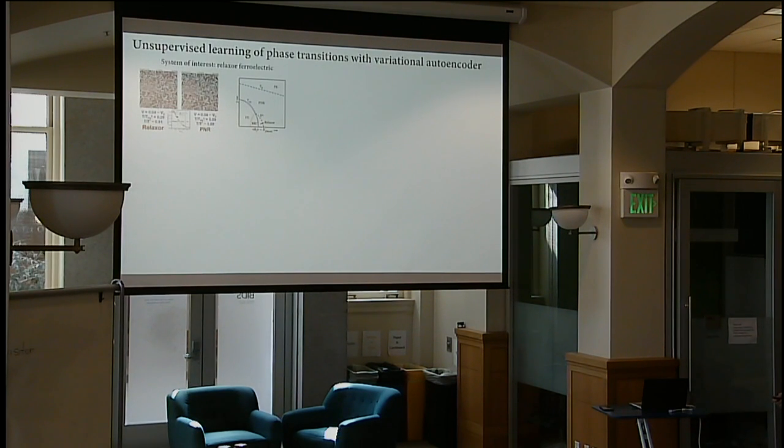Okay, one other thing that I wanted to show today is not directly related to atomic scale imaging, but it is related to the type of problem that we are solving with microscopes as well. So here, the type of data that we have are the atomic coordinates and how they change as a function of temperature.